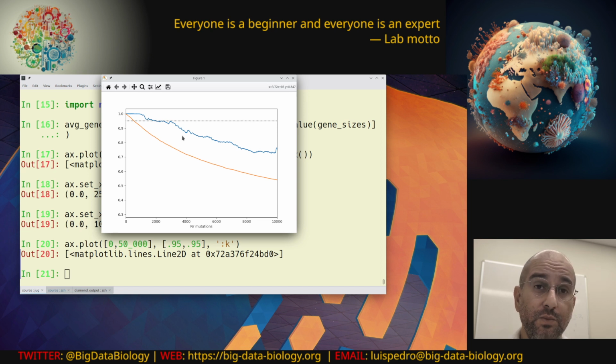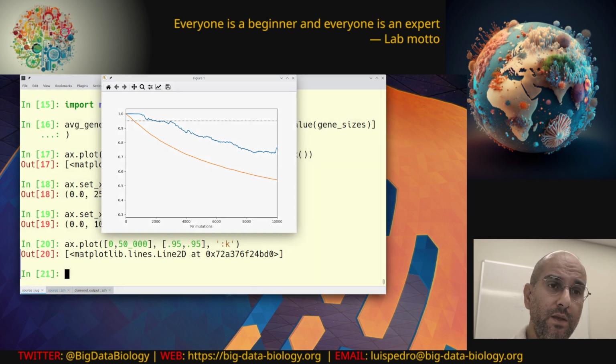So the size of the genomes in this case, we are removing a few base pairs here and there, but adding some others as well, and in expectation the size doesn't change. We're as likely to add a base as to remove a base. So this is nice, that we see the completeness drop even though we don't have less sequence, we just have worse sequence. And that gets reflected in the completeness.